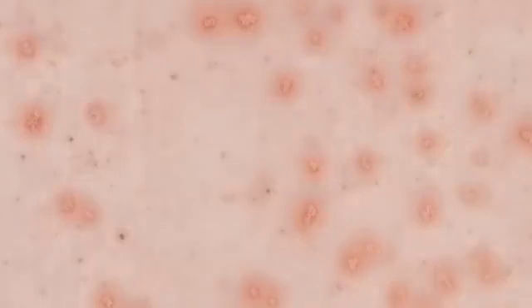And we're going to increase power. And we're going to increase power again. This is now 40 times. And now you can start to see individual cells. That's a cell, clump there. Now we're going to move to oil immersion.